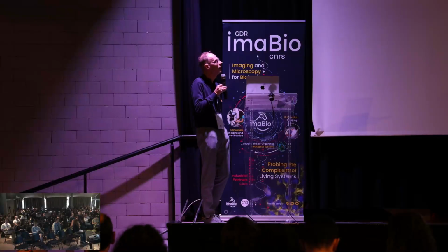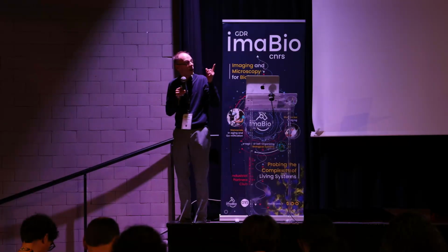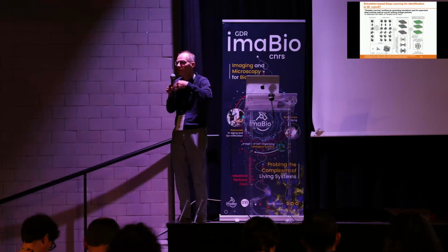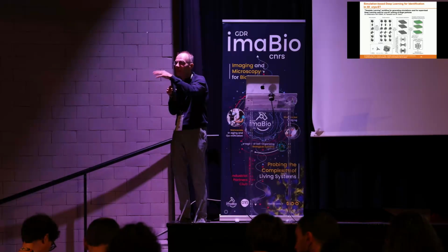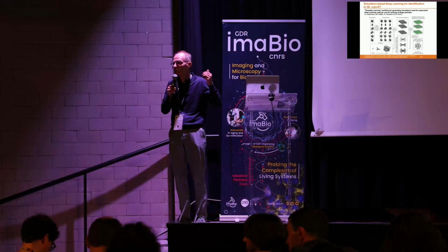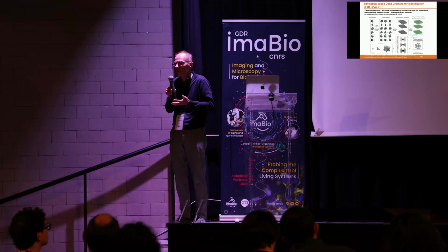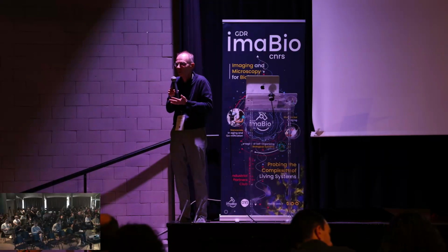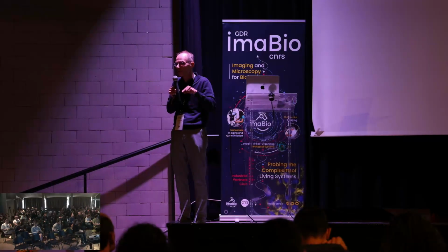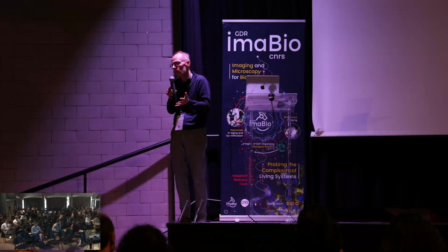For sure, for the PDB, we cannot do anything. So we benefit from this library. We apply here, we deform the macromolecules to improve the variability and to map better to the real data. That's why we apply molecular dynamics to deform the structures. But of course, the starting point is the PDB. It is probably biased, as you said, but it was the starting point. Now, because the objective is just to detect where the particles are and to count the number of particles, macromolecules, maybe this approximation could be okay.